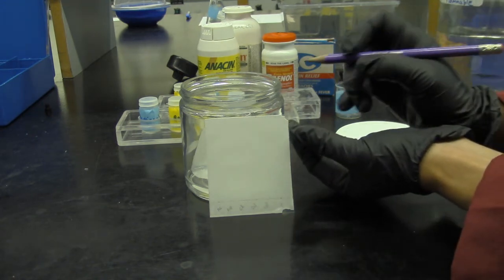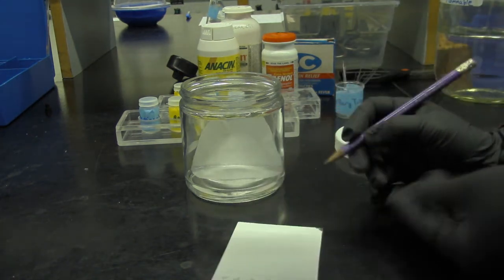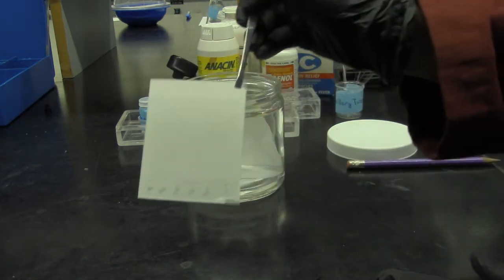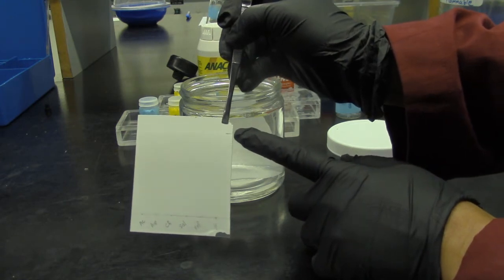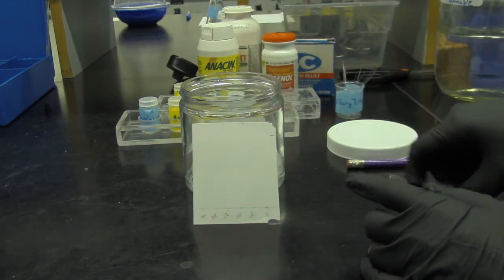I'm going to make a tick mark before it completely dries off. So this is the solvent front. That's where I stopped it, right? Okay, and I'm gonna let this plate dry off.